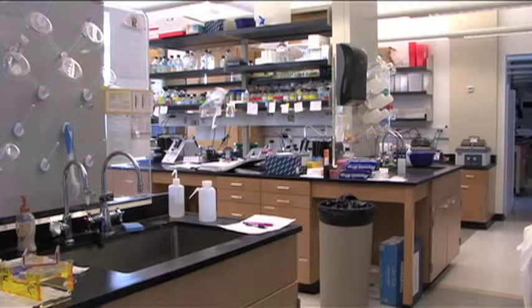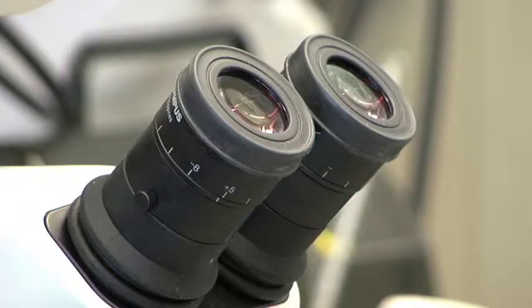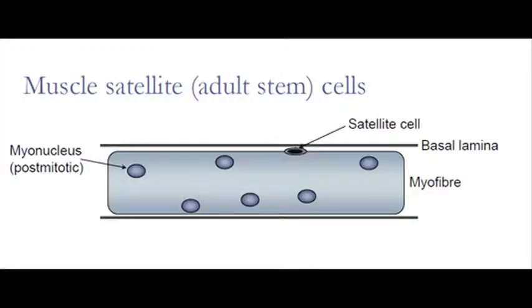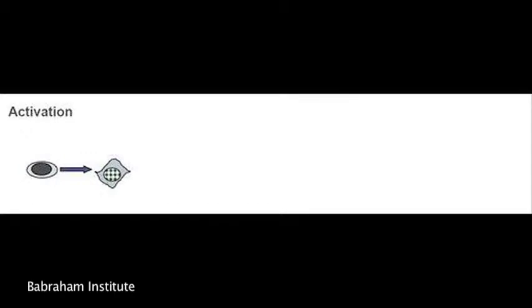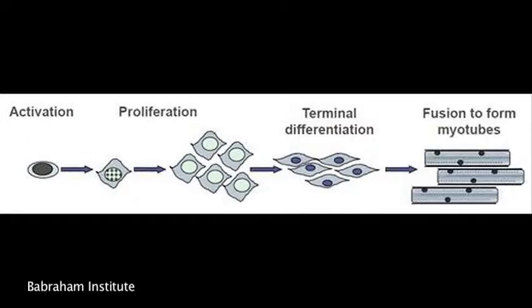This is the Cornellison Lab in Bond Life Sciences Center. They are part of the biology department, and the focus of their research is signaling and activity of skeletal muscle satellite cells. Satellite cells are adult muscle stem cells. When activated, they proliferate and differentiate before fusing to the muscle fiber for repair.